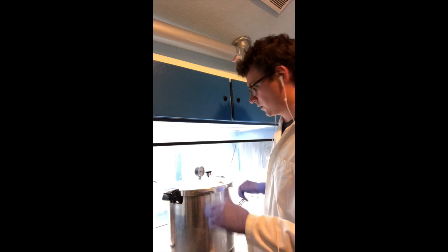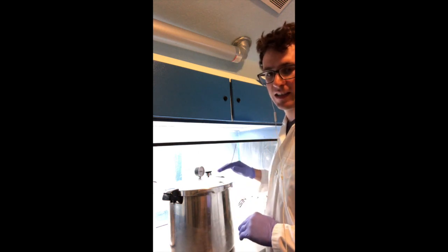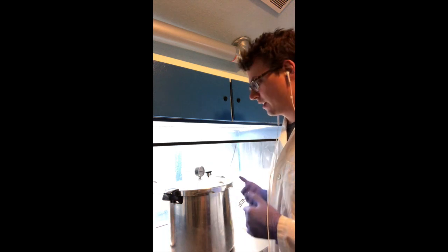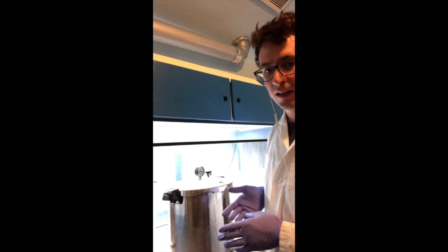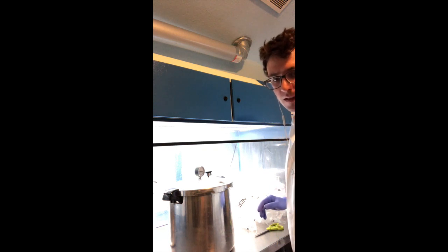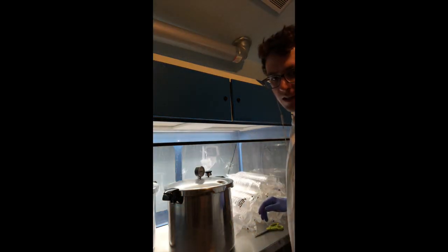All right, so the agar is done sterilizing, it has just cooled, and I'm gonna open up these pressure cookers and begin the pouring. So I'm gonna focus this in over here.